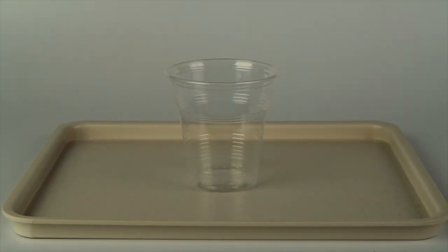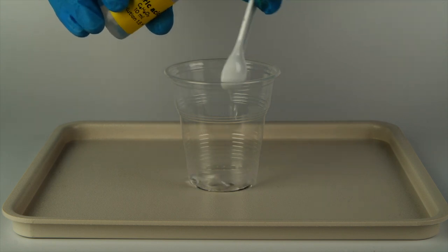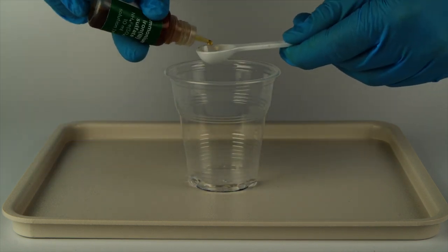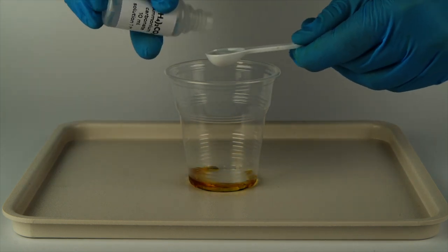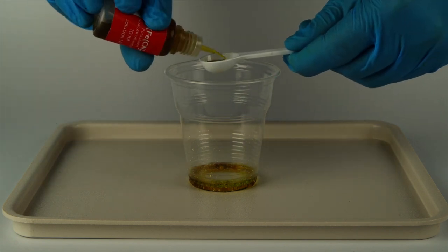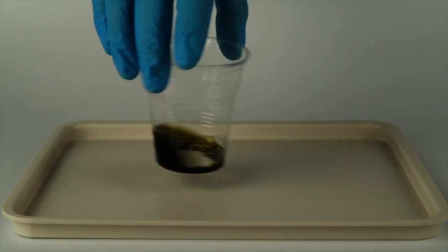Next, prepare your light-sensitive solution. Measure one big spoon of citric acid solution into a disposable cup. Add one big spoon of ammonium iron 3 sulfate solution. Add one big spoon of ammonium carbonate solution. Add one big spoon of potassium hexocyanopherate 3 solution. Mix the contents of the cup by swirling them around.